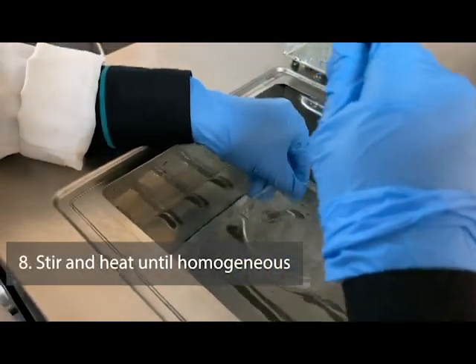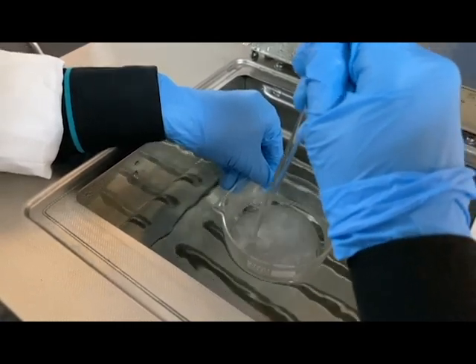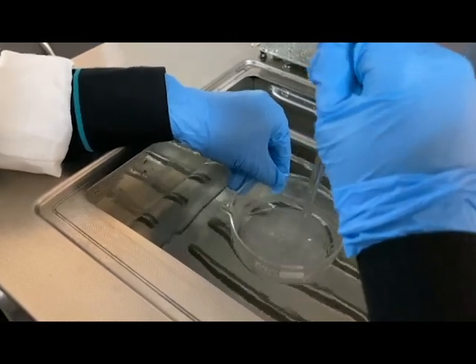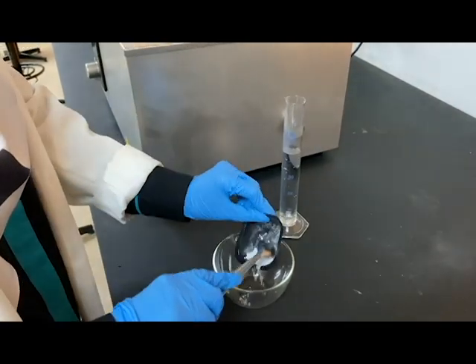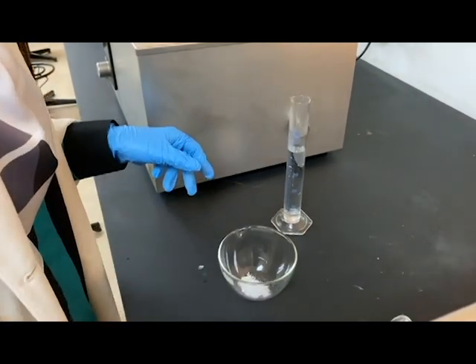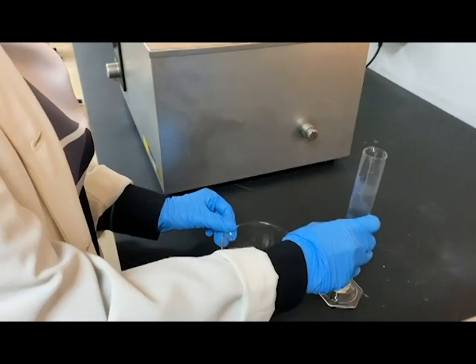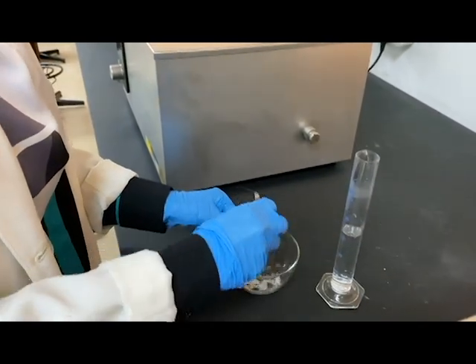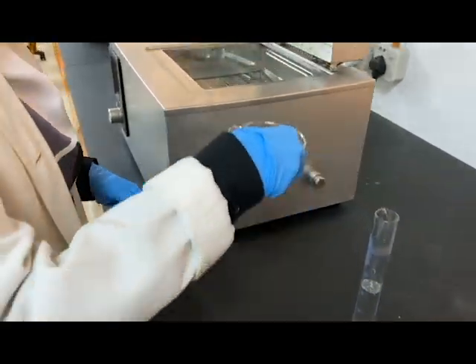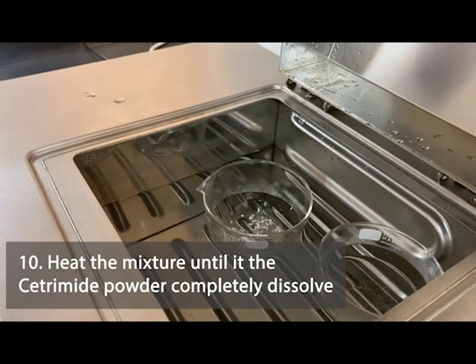Stir and continue heating until the mixture becomes homogeneous. Dissolve the Cetrimide powder in sufficient purified water. Then heat the mixture until it completely dissolves.